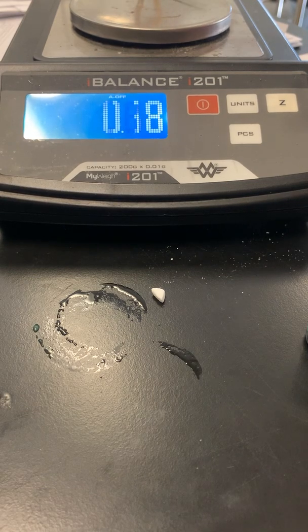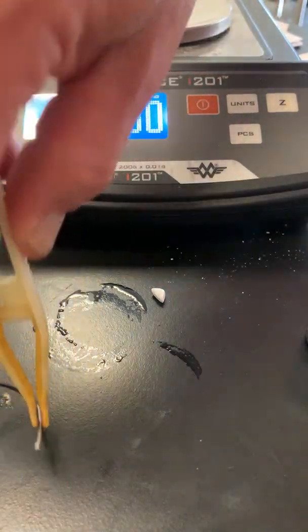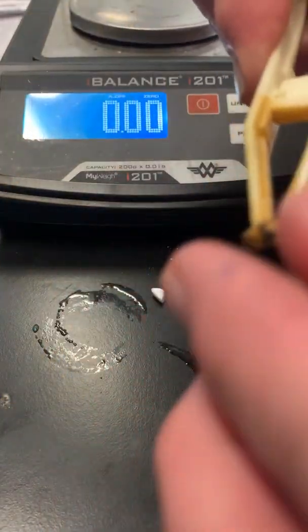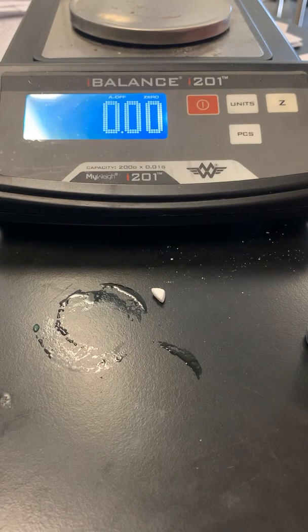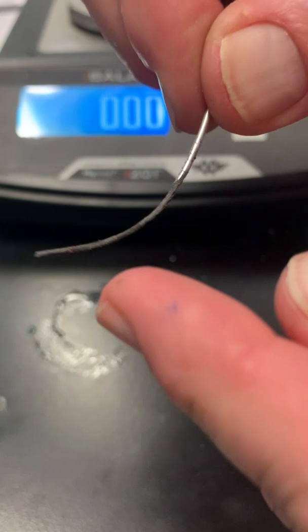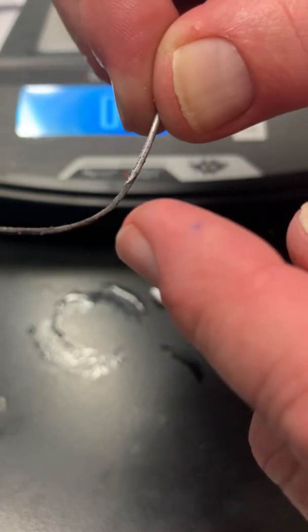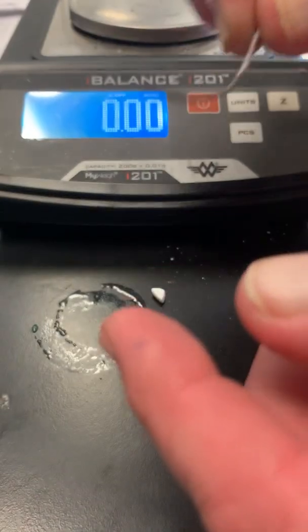So this is what the reaction did. I can touch aluminum. You can touch copper too. So see, it's gotten much thinner. So I've used up the aluminum to make my copper, and that's happening here.